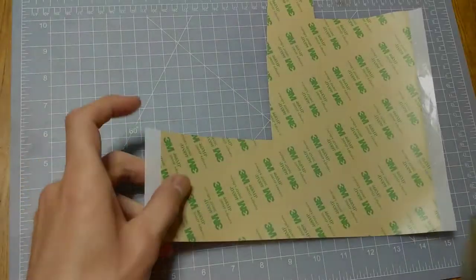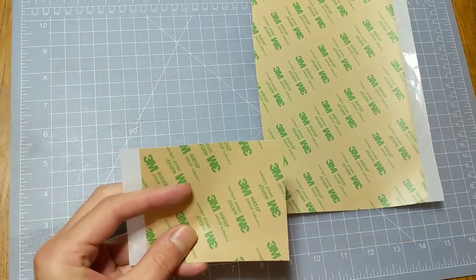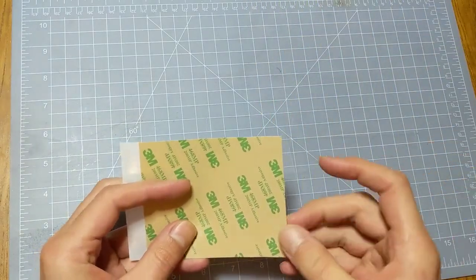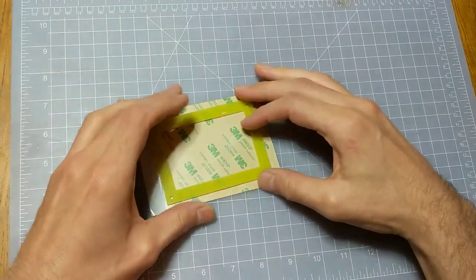First up we'll cut out a strip of the adhesive to attach to the FR4 frame. It just needs to be big enough to cover it. So that looks good.